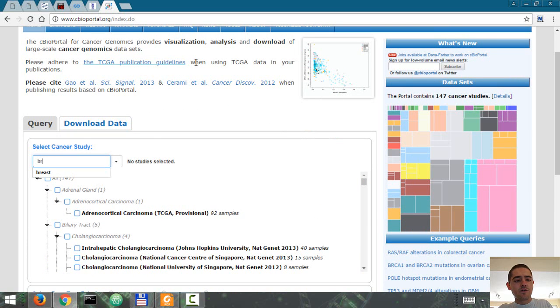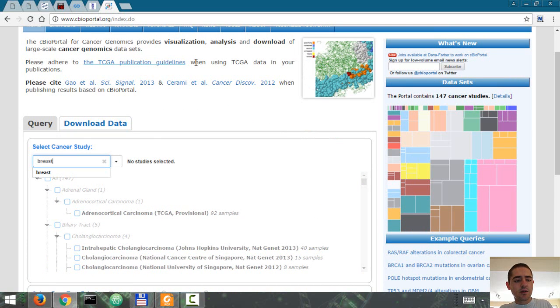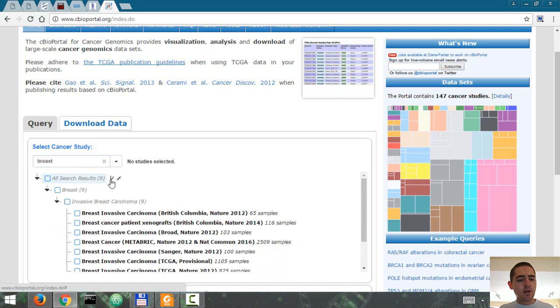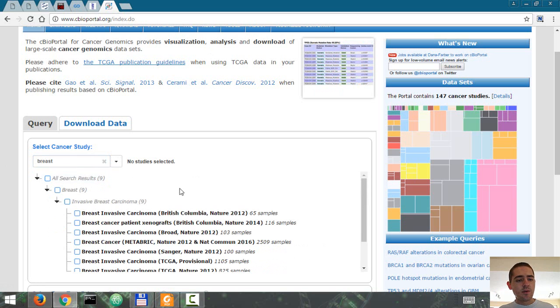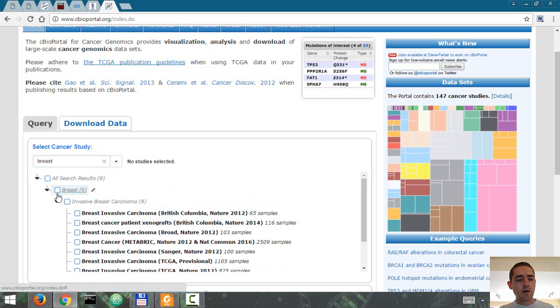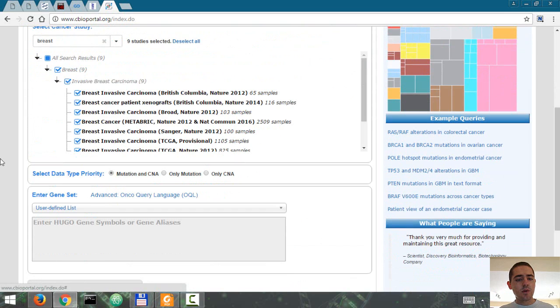So let's search for breast. And there are currently nine studies with cancer genomics data. And I'm going to select them all.